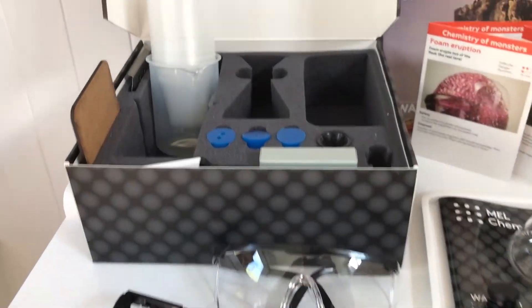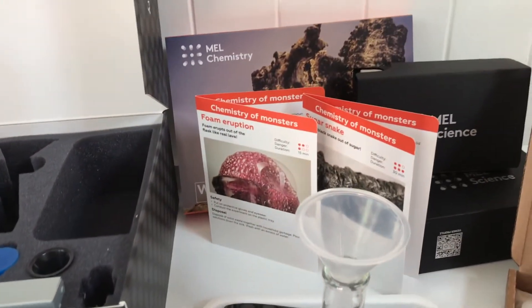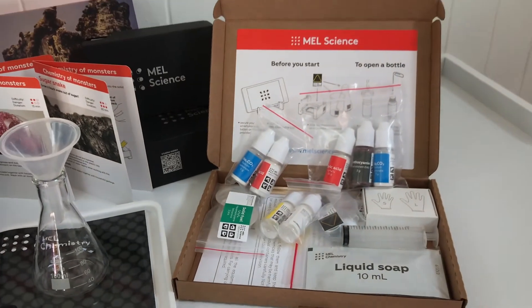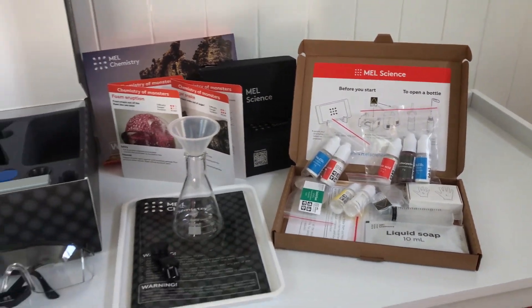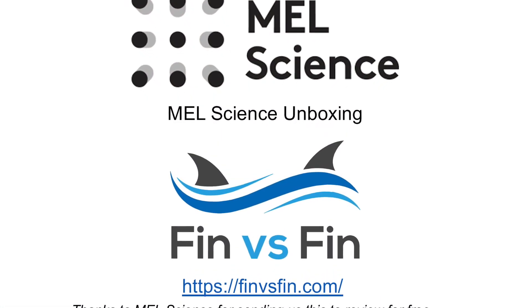The overall review for this MEL Science kit would be that it's pretty fun. You get quite a bit in the starter pack. It does require some adult supervision because you're using real chemicals, and some of the experiments actually involve fire. If you want to learn more about MEL Science, visit finvsfinn.com and we'll do a full review there.